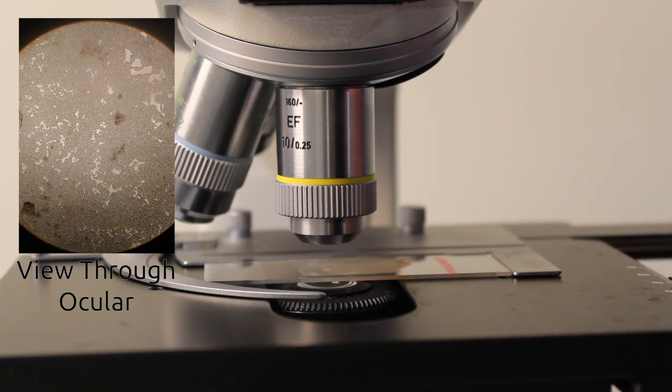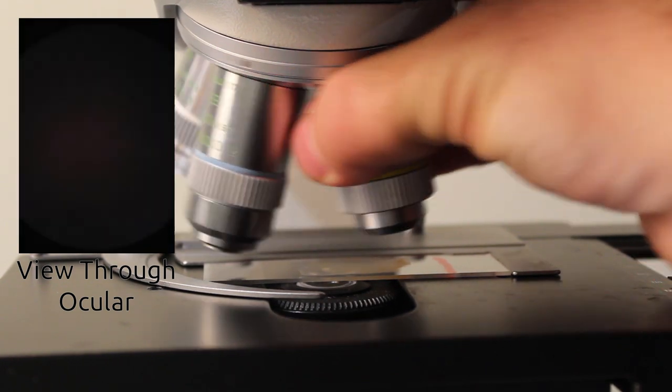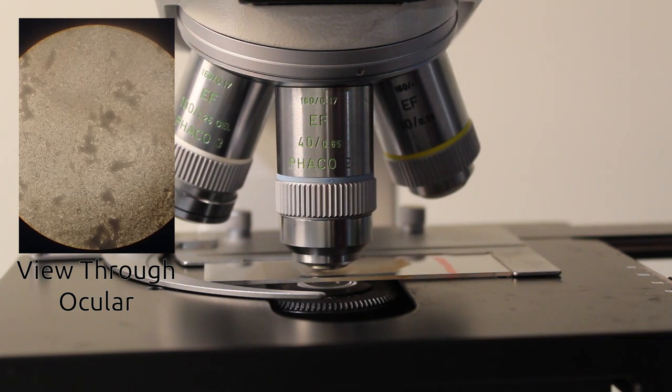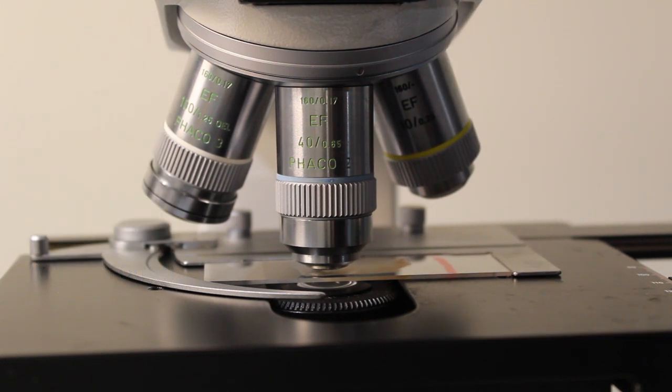Most microscopes are set up to be parfocal and what that means is if we rotate our lens from one to the next, the next lens should automatically be in focus or only require very minor tweaks using the fine focus knob.